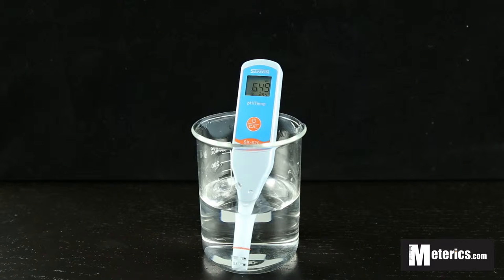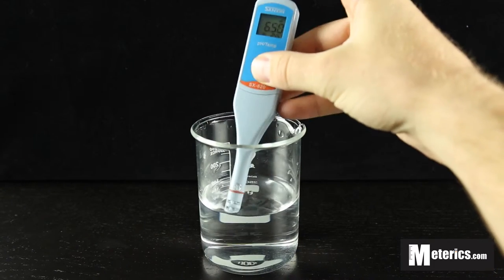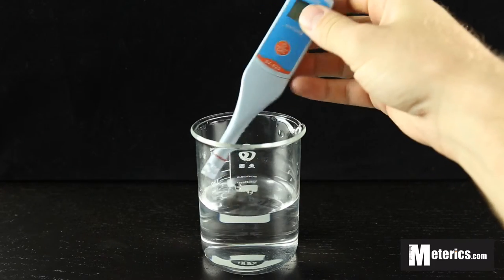Hi guys, I'm here with Metrix and today we're looking at the Sanshin SX620 pH meter. This particular pH meter is very simple to operate, as it features one button for on/off and calibration. Today we're just going to be going over how to operate the meter, so stay tuned for further videos where we'll be showing you how to calibrate them.